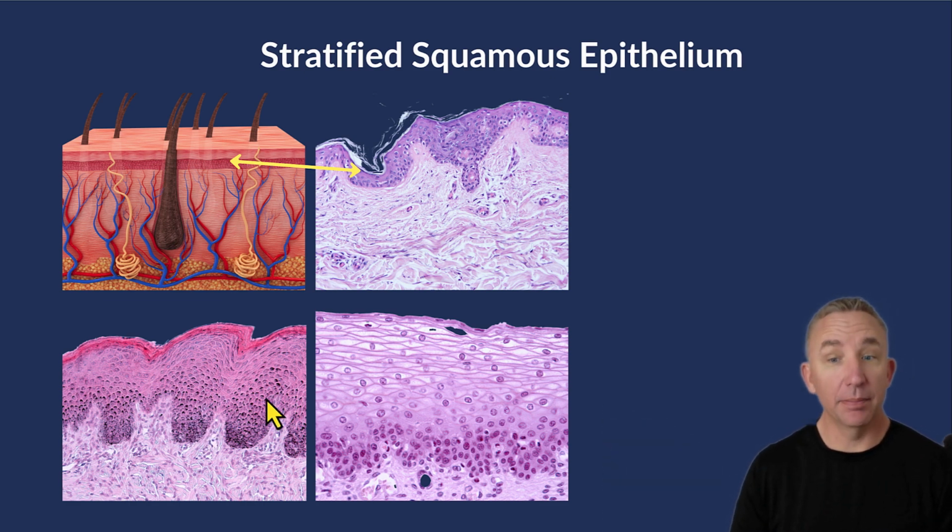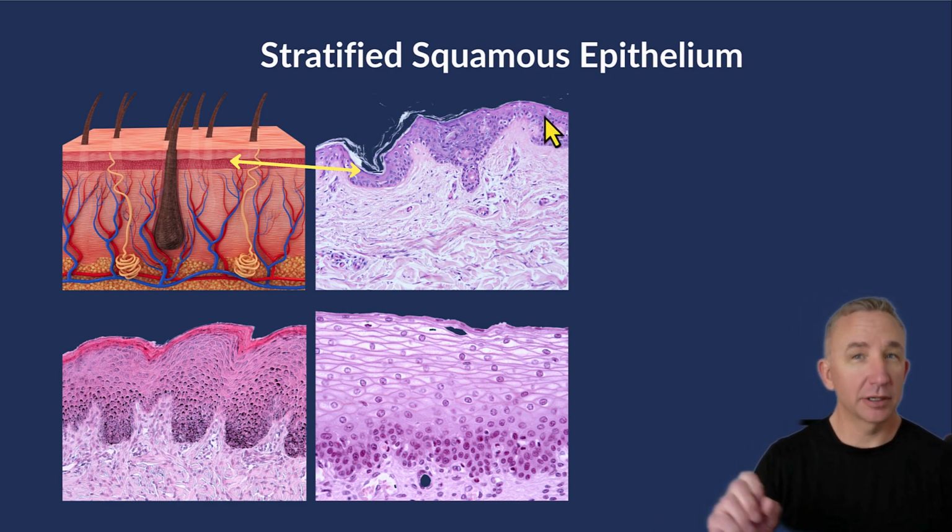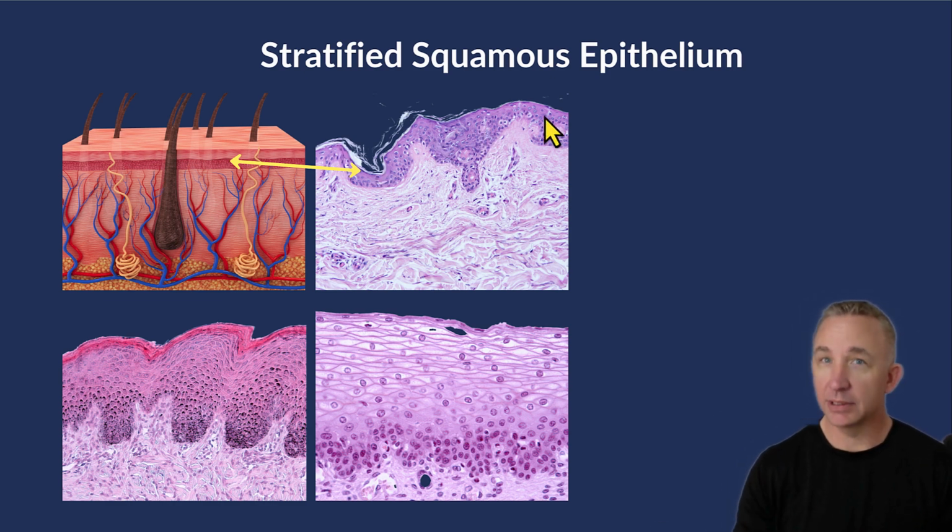If I magnify it more, this is the end at that basal surface. Deep to that is my underlying connective tissue, but this is all stratified squamous epithelium, just a nice purple ribbon. So just learning the terminology: the layer, epidermis; the type of tissue, stratified squamous epithelium. Why is it stratified? For that protection.